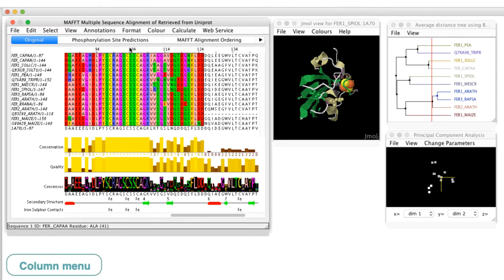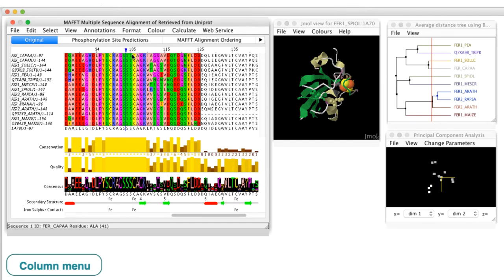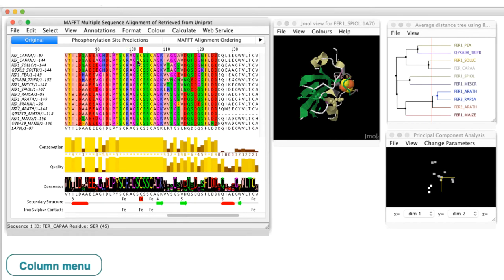The column context menu can be accessed by placing the mouse cursor on the column ruler then right-clicking the mouse for hiding columns, or placing the cursor on the blue arrow and right-clicking the mouse to reveal columns.